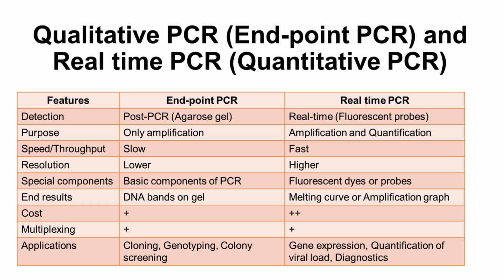What is the purpose of endpoint PCR? It is only amplification. What is the purpose of real-time PCR? You can simultaneously amplify and also quantify, and there is no manipulation after PCR, meaning there is no labor post PCR. What about the speed or throughput?